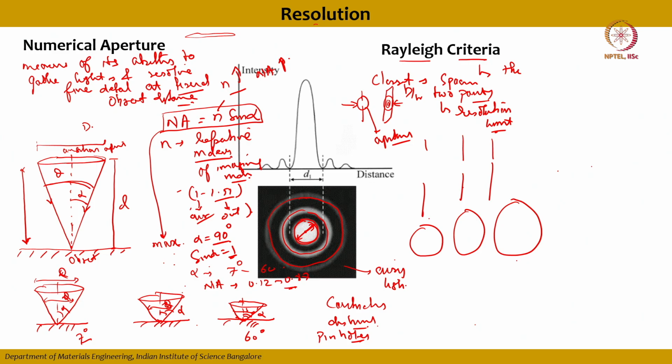So diffraction can occur from every small point in the object. Okay. So the small points in an object can also become Airy disks in the image. In this Airy disk, the intensity will be maximum at the center, and after a particular distance it decreases, then increases again. This is directly related to the constructive and destructive interference of the diffracted beam of light.